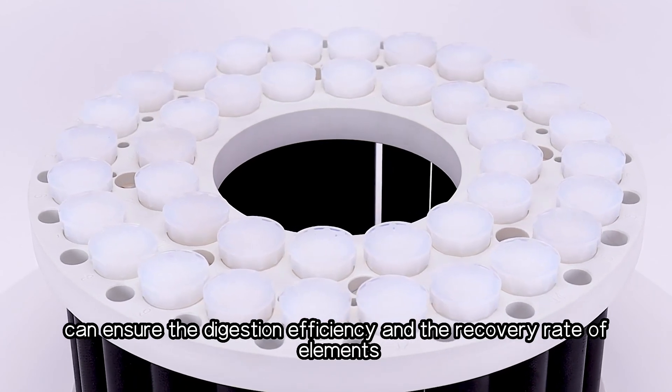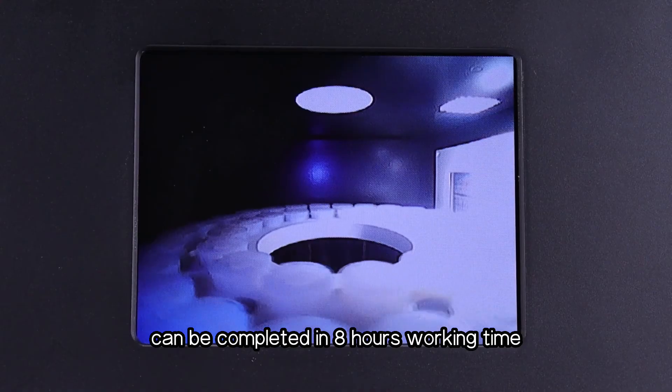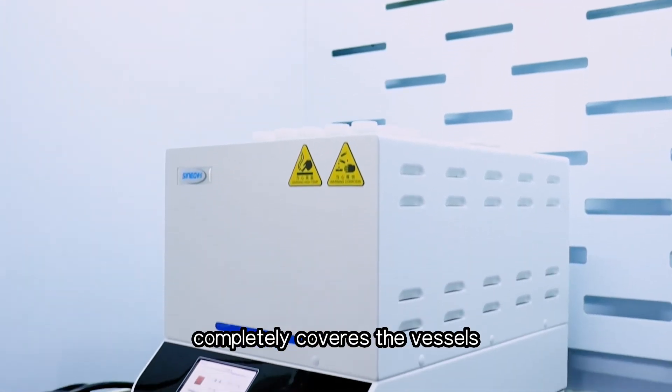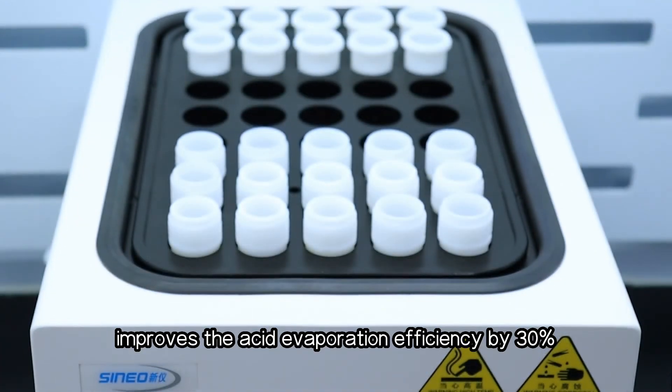The 40-position ultra-high-throughput rotor and high-pressure vessels ensure digestion efficiency and high element recovery rates — as many as 160 samples can be completed in eight hours. The deep hole hot plate completely covers the vessels and improves acid evaporation efficiency by 30 percent.